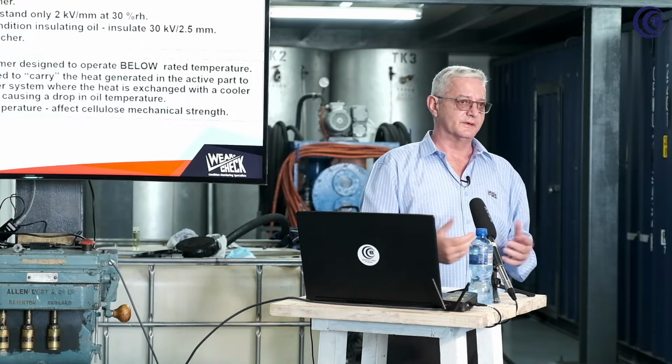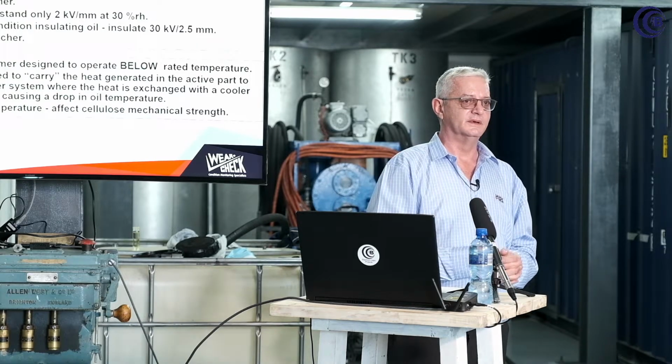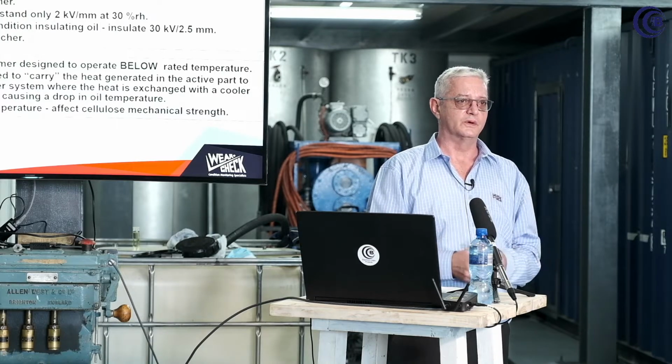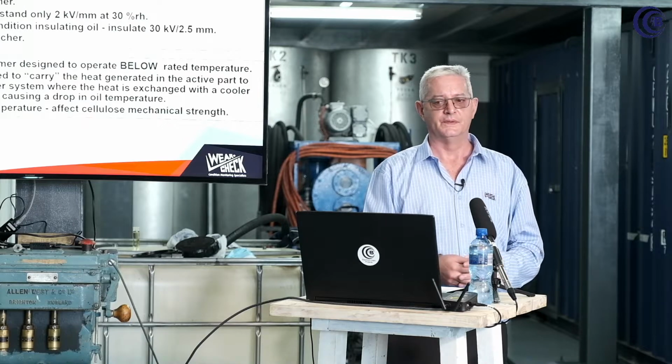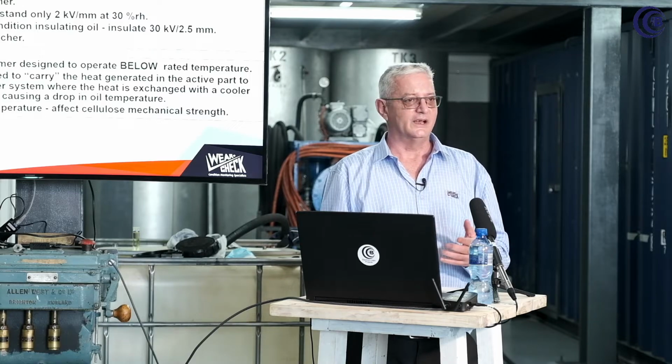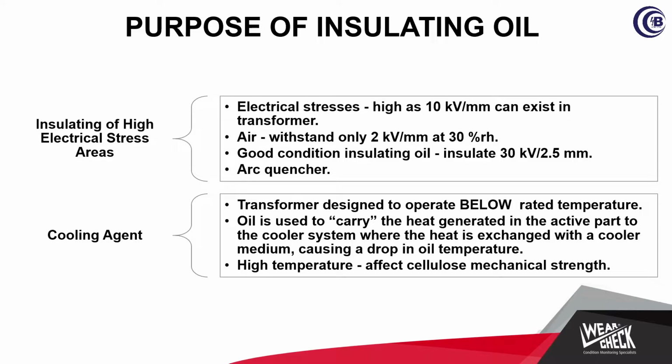So what's the purpose of transformer oil in transformers? Firstly, it needs to insulate the whole transformer, the core. You don't want any flashovers in your core. The second one, it needs to cool the transformer. For those, we need to do testing to see if both those areas are still being done by your transformer oil. If any of the tests fail, the client must get someone like Bemont Cape out to do maintenance on that oil. And the maintenance is to extend the lifespan of your transformer oil.